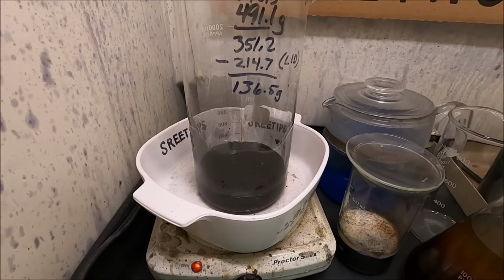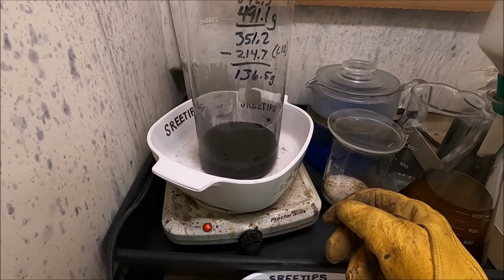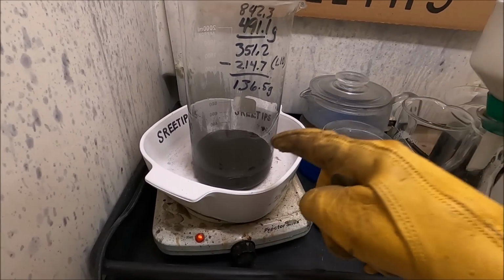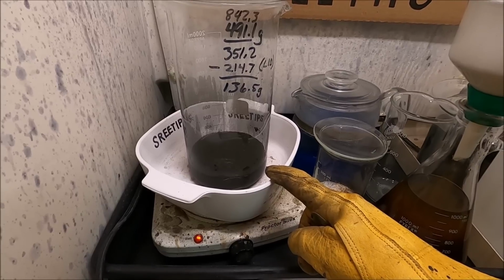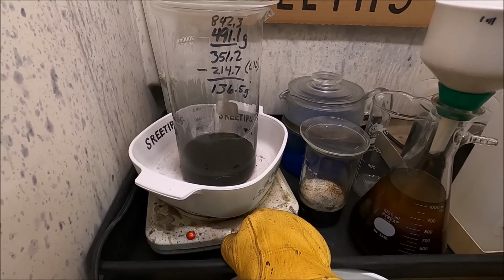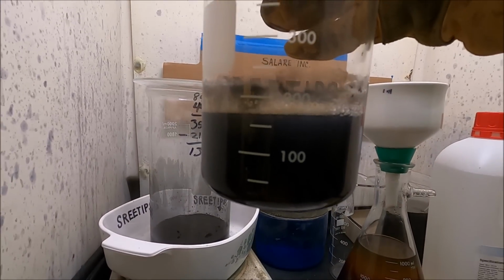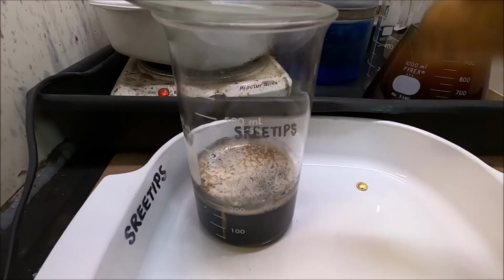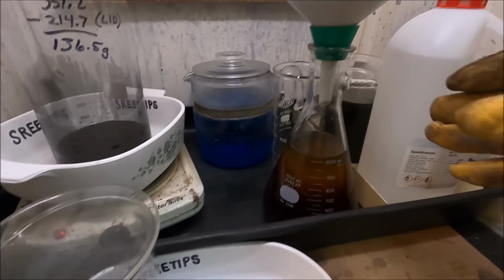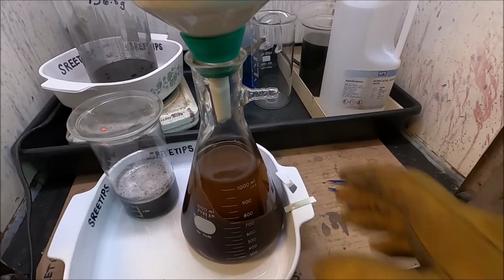Up here I'm doing a second extraction on this material in this beaker, but I'm not getting a whole lot of metal to come out to go into solution. I may have some rhodium and other platinum group metals in here that I can't dissolve with aqua regia. So we have to take a look at that. Turn the heat off. In this beaker we've got the metals from the DMG extraction. They're cementing out. That's coming along pretty good. Over here we've got our platinum group metals separated from the gold. So that's coming along okay.